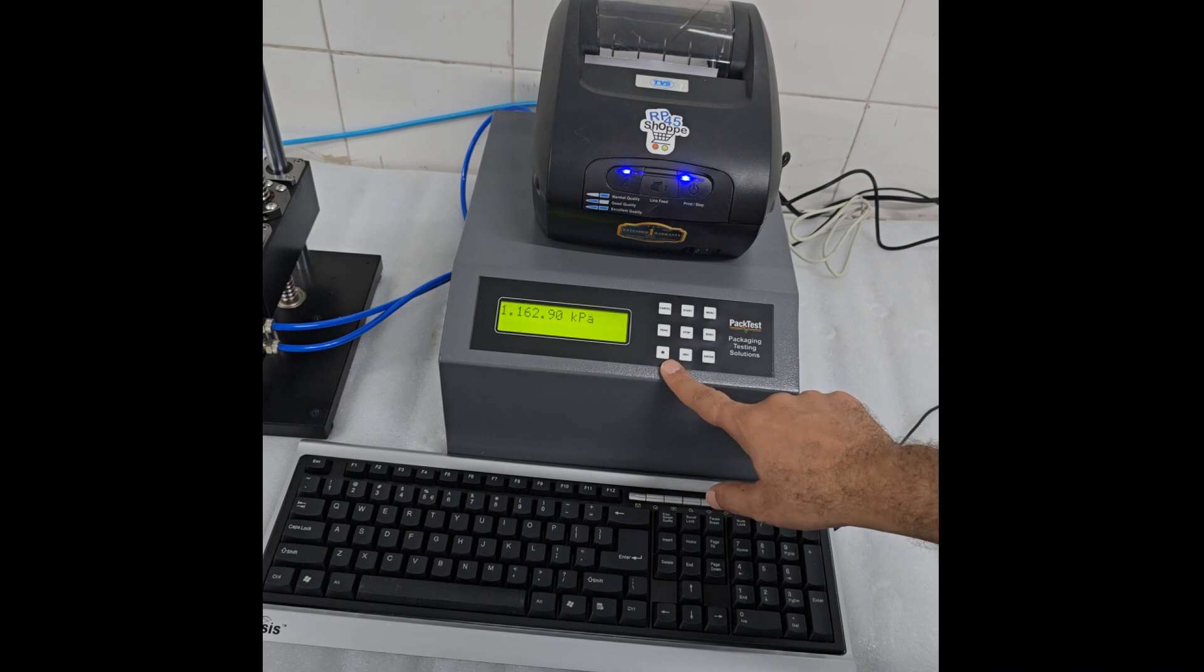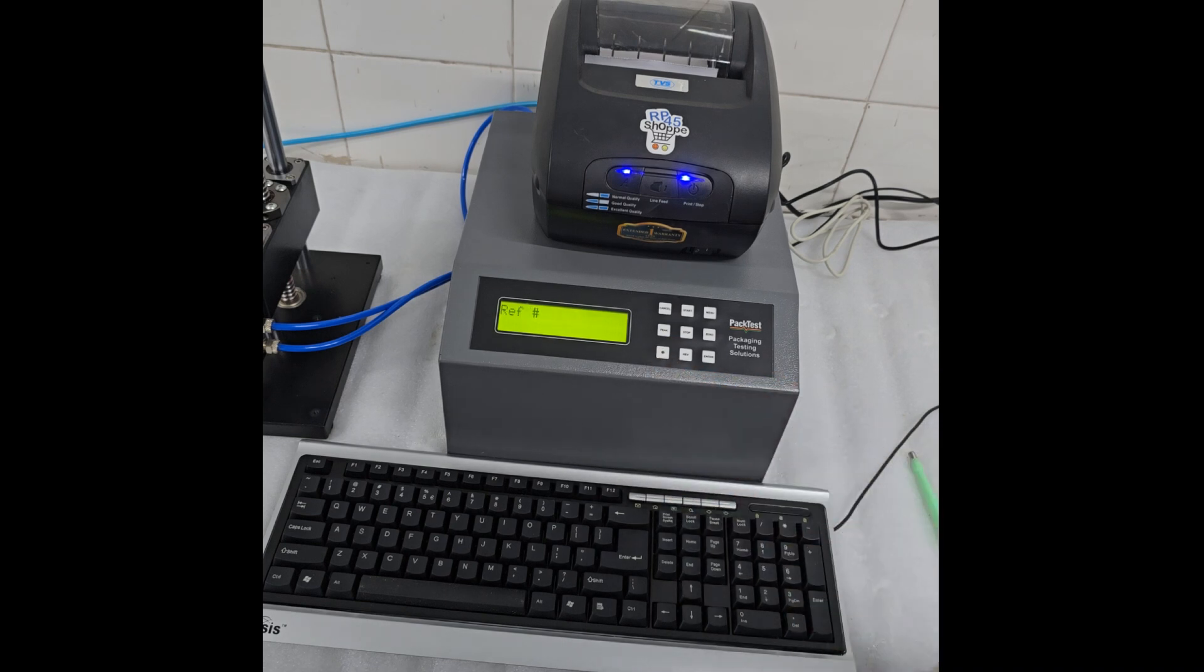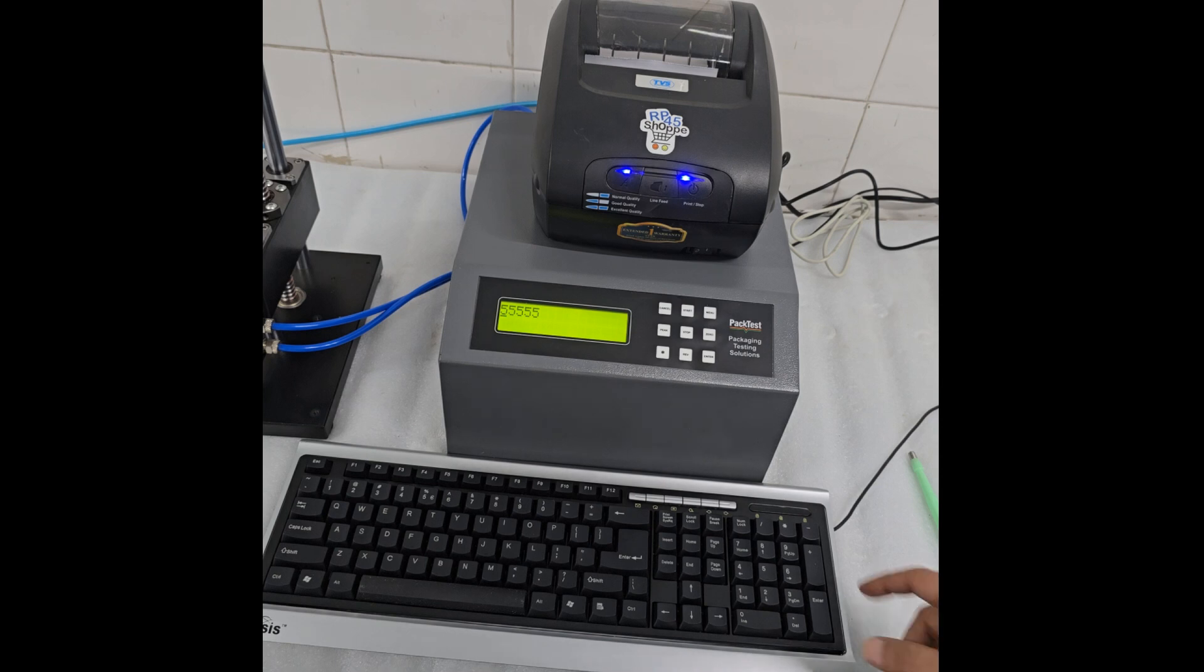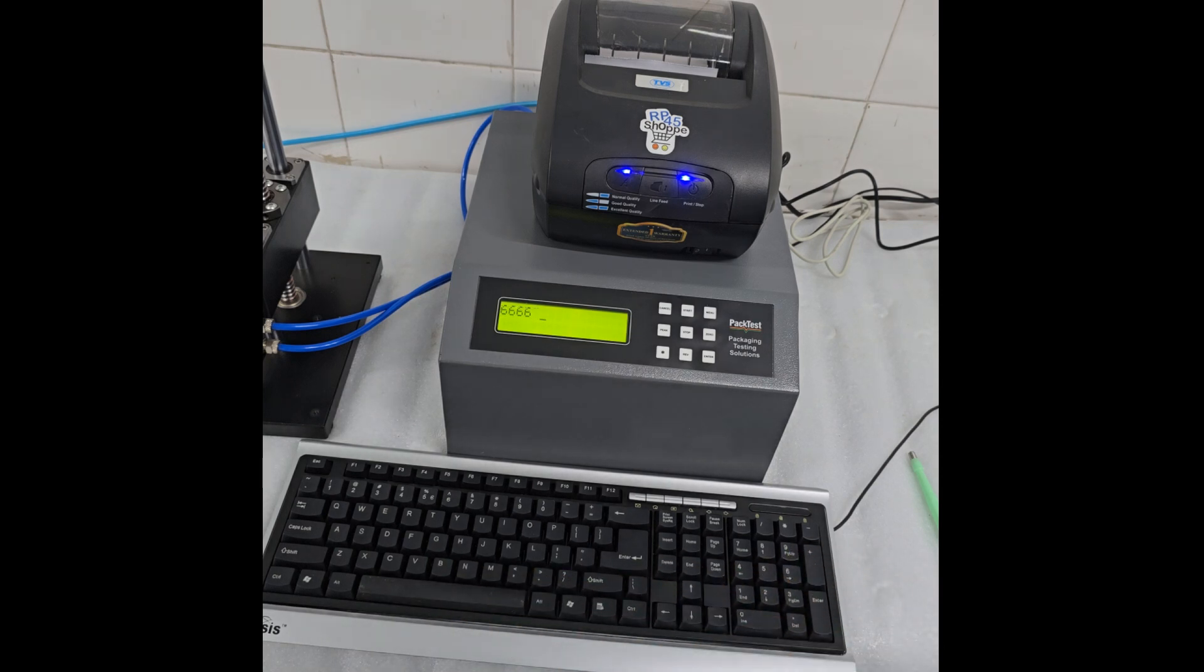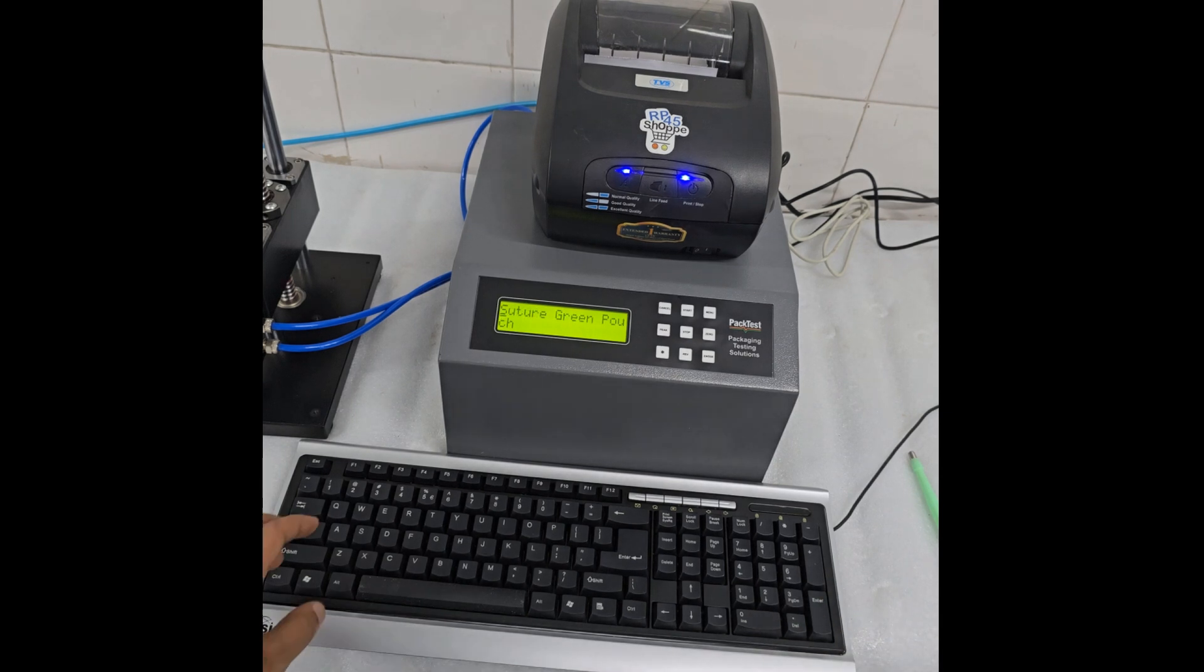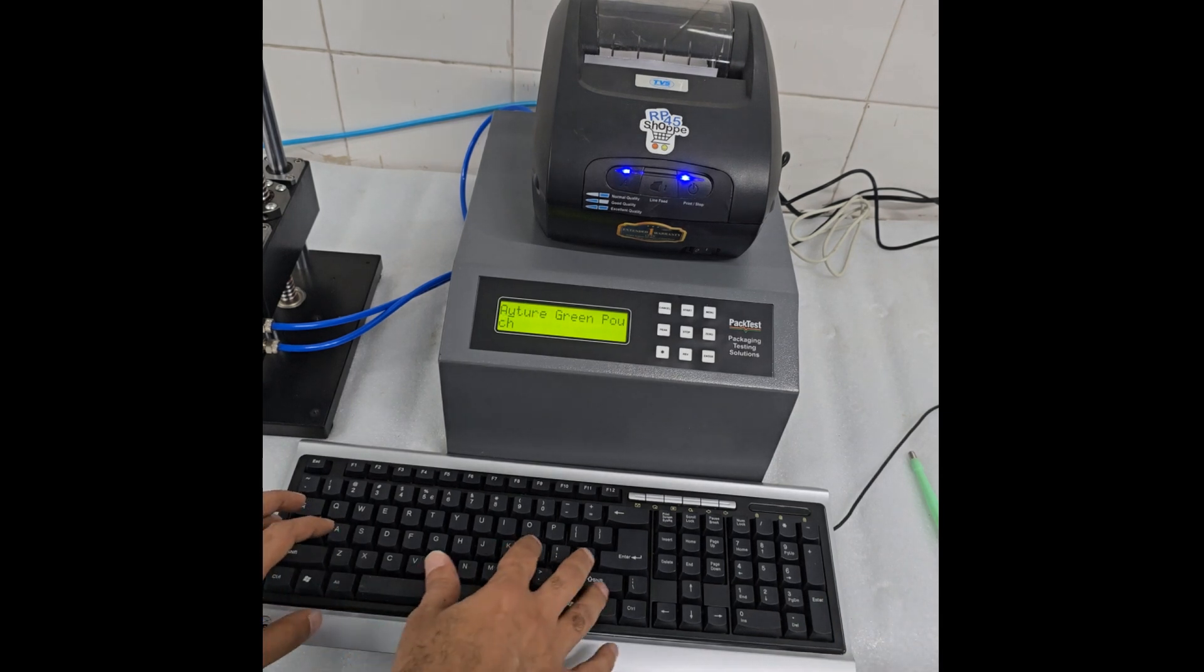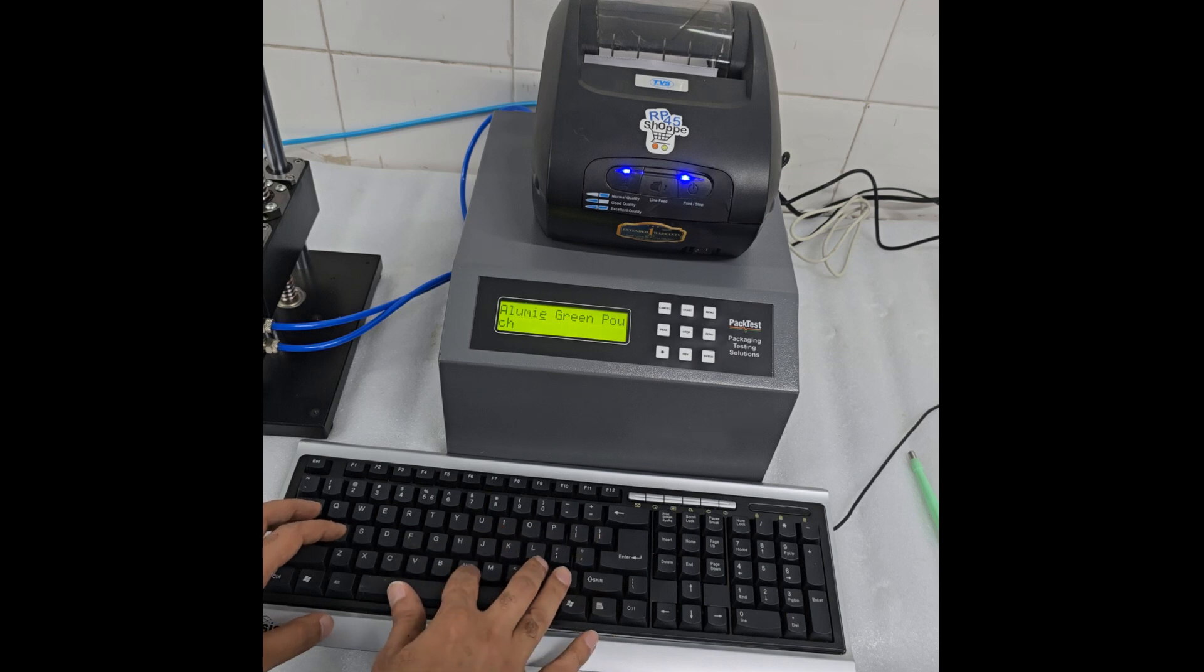To take a print, press the Star key on the bottom left. Now use the keyboard to type a reference number or ARN number. Then press Enter. Now use the keyboard to type the sample name or product name. Then press Enter.